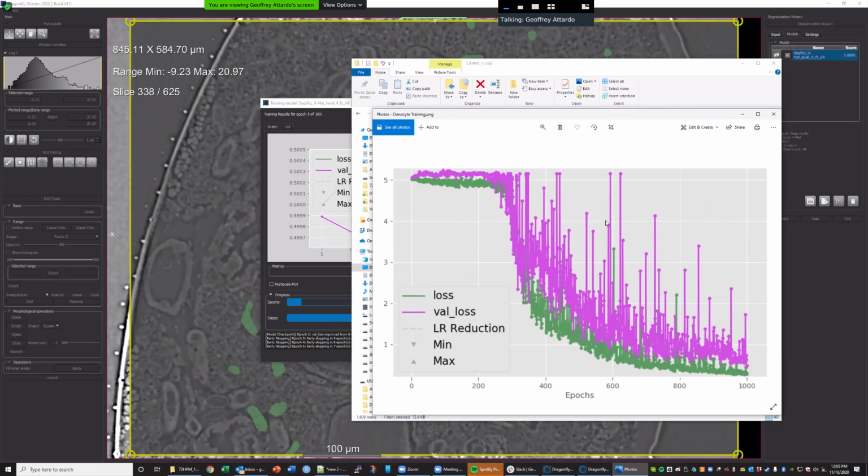I did make a second model, and I didn't see nearly the amount of variability that I did with this one. But I still had the same outcome where it was able to make predictions on the training set on the unmasked areas fine. But when I opened up the other data set from which those slices came, to apply it more generally, it didn't identify anything. So I don't know if it's overtrained, if it's recognizing training set specific features somehow. That's the overfitting issue people are talking about.